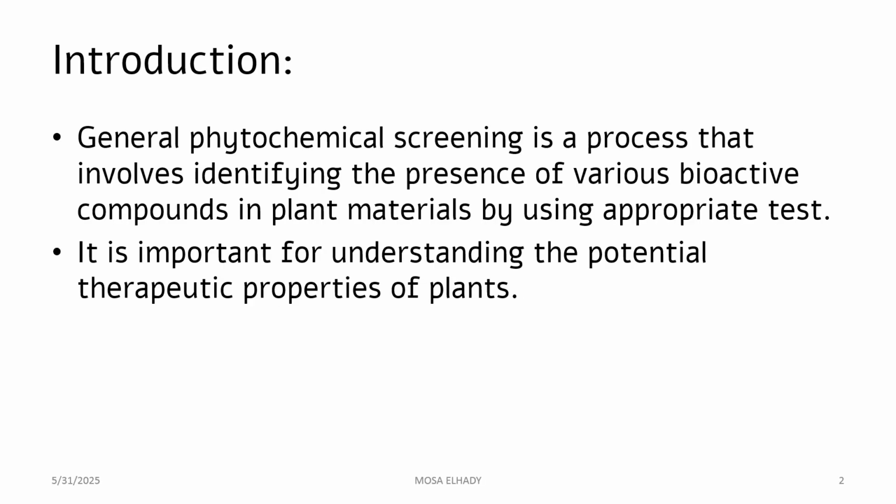As a brief introduction, general phytochemical screening is a process of identifying the presence of various bioactive compounds or secondary metabolites in plant material by using cost-effective or appropriate tests. And the main purpose of phytochemical screening is to understand the potential therapeutic properties of the plant.